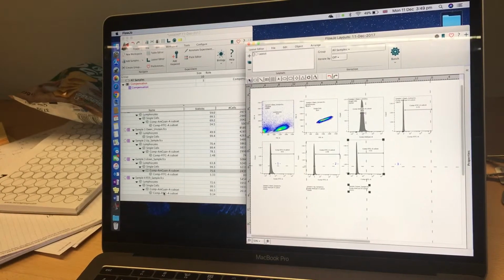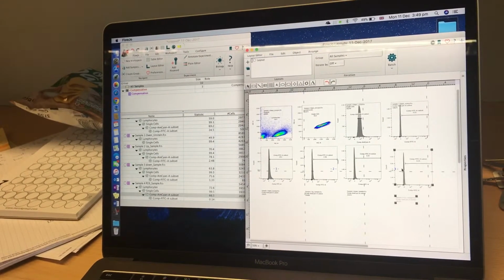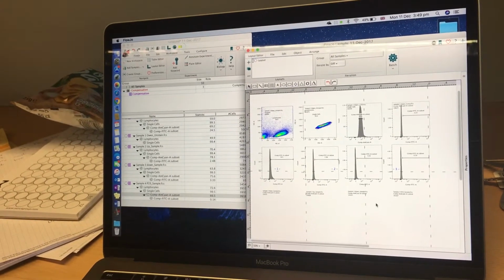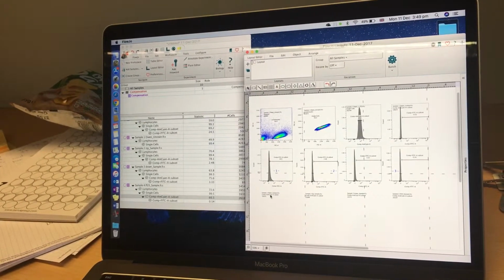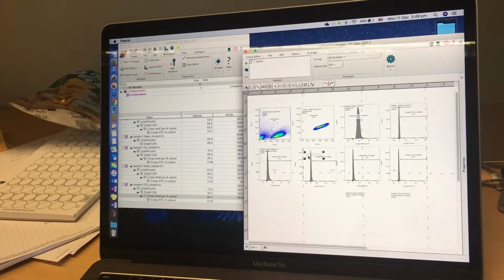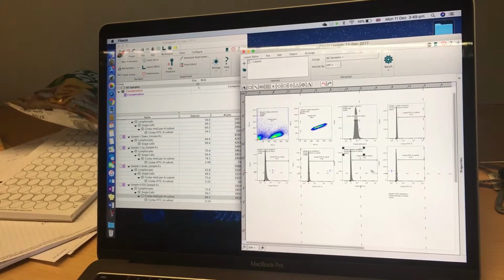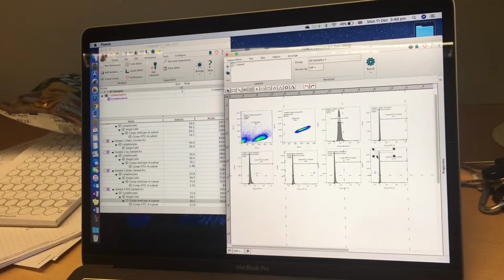And there was one more, wasn't there? P29, passage 29. Have a look at them. 0.14, so even less. So there's no expression. The only expression is in the sample you got from me from that group. So you put that there, and that's what your results will look like. It's much easier to see now, because you don't have pages of stuff. You can just show it very easily with one page.